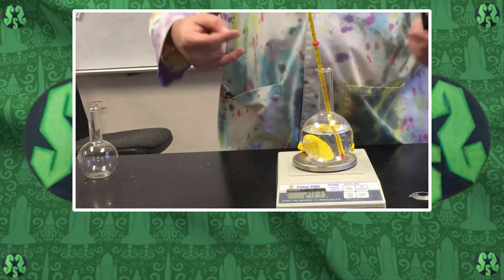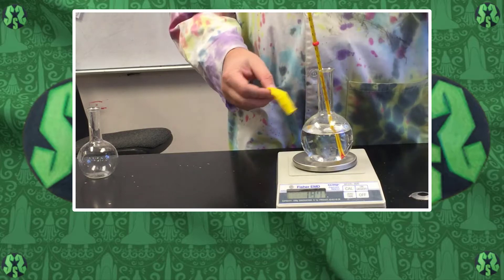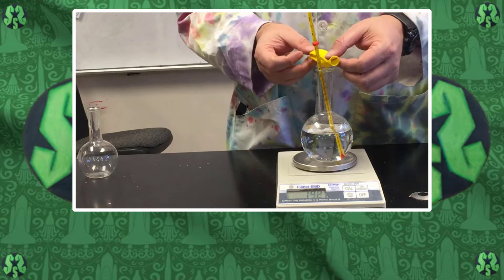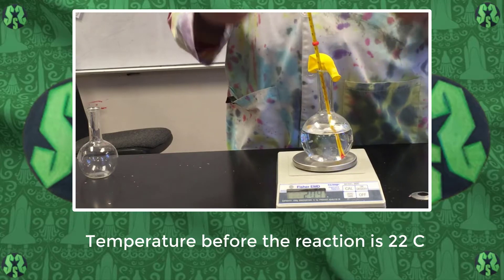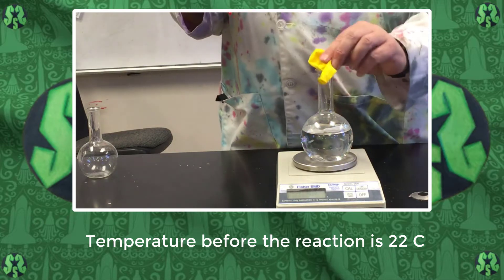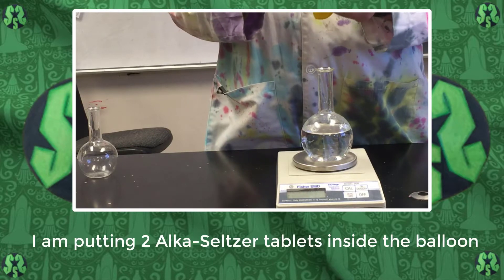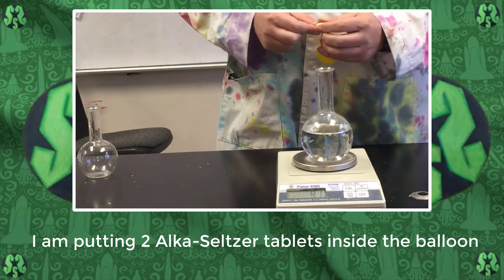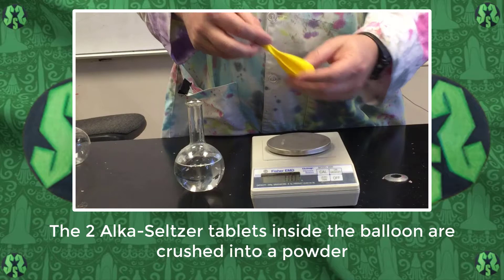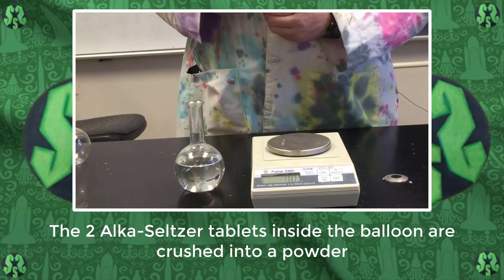Alright, so we have a balloon, a flask, and two Alka-Seltzer generic tablets. I have a thermometer in here - it says it's 22 degrees. I'm gonna take that out though because I don't want the mass of that. I'm gonna take these tablets, put them in the balloon, and try to crunch them up a little bit so they're more powderized.